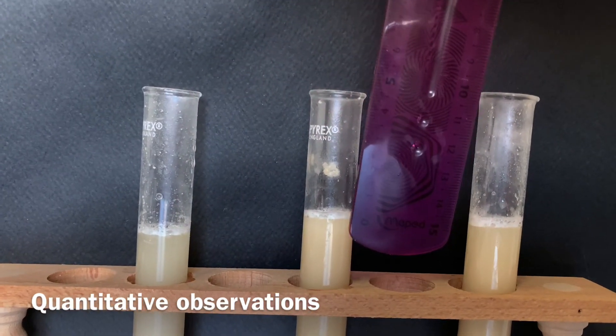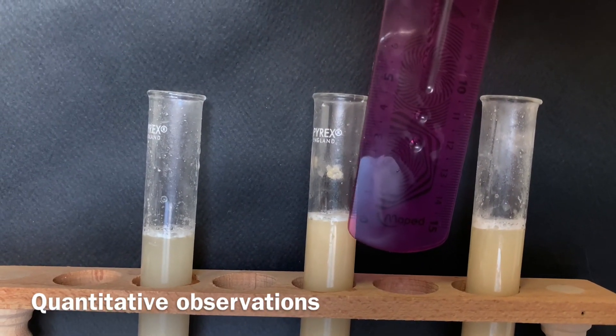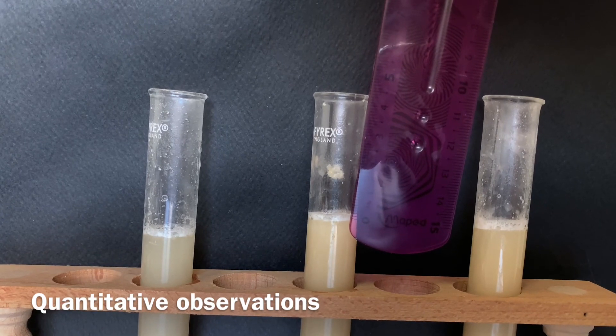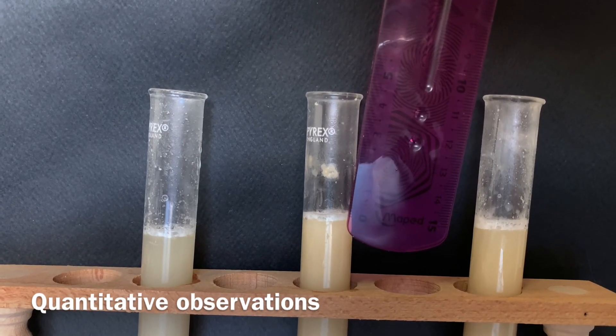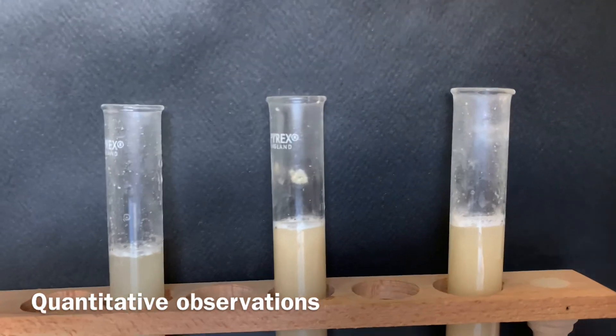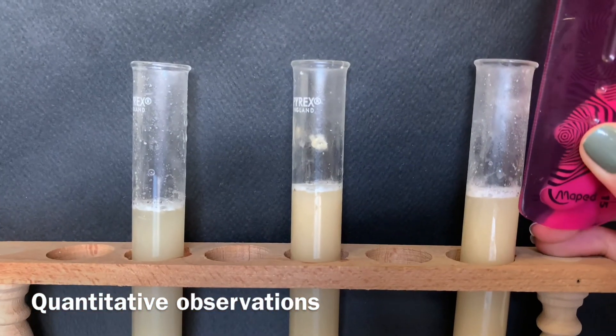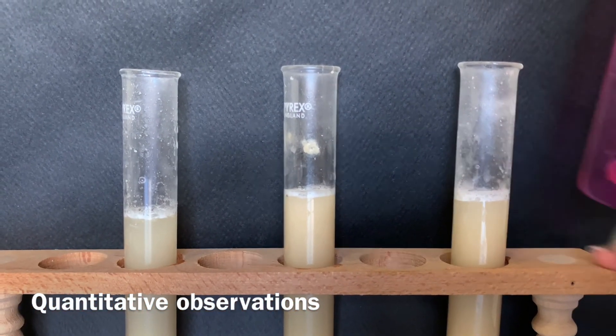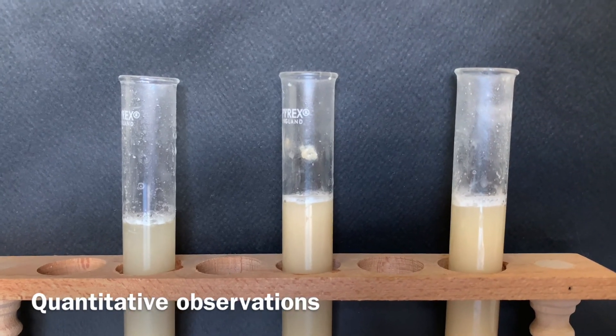In the second test tube we have around 0.3 or 0.4 centimeters, and in the last test tube around 0.6 centimeters of bubbles were produced.